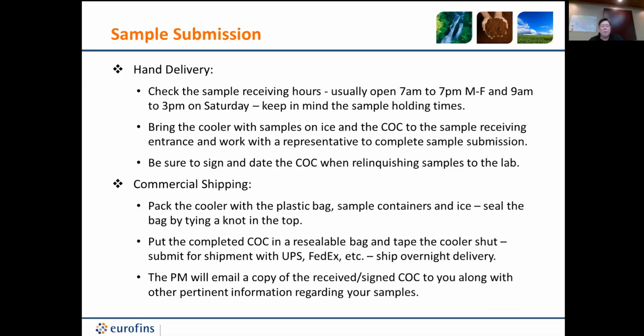We would like to get them into the lab within 24 hours. With the 48-hour holding time, that gives us then 1 day to work on it. So we want to make sure. And the 48 hours is 48 hours. It's not like 2 days, midnight of the second day type of thing. It's to the hour. Thank you.